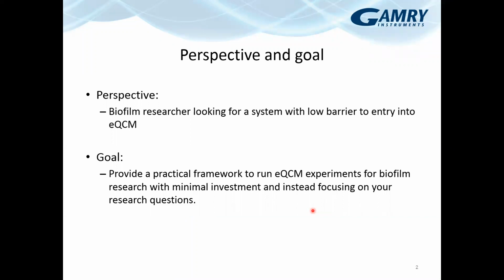In my experience, we tend to have to piece together different parts from different vendors in order to make something work. The idea of growing a biofilm in situ in an electrochemical system is one thing, and then adding on top of that another device like a quartz crystal microbalance, it gets really challenging. And so that's the perspective that I'm going for.